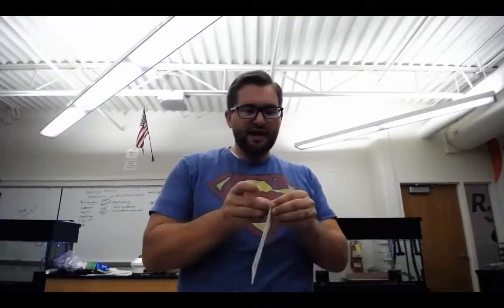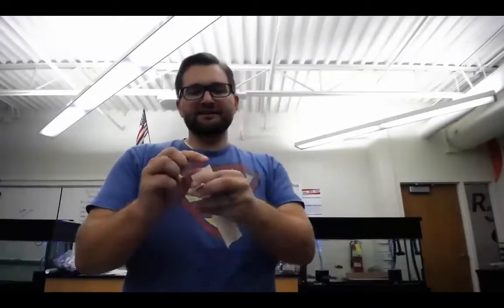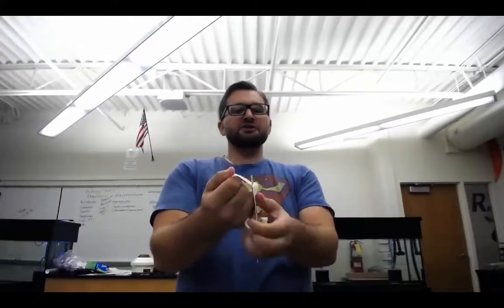Alright ladies and gentlemen, you are going to take your cotton tip applicator. You are going to open it so that it remains sterile — open the right side so it remains sterile. If you open it up it just peels back, and you'll notice you can just grab a hold of one of the cotton tip applicators from the back side, from the handle side.